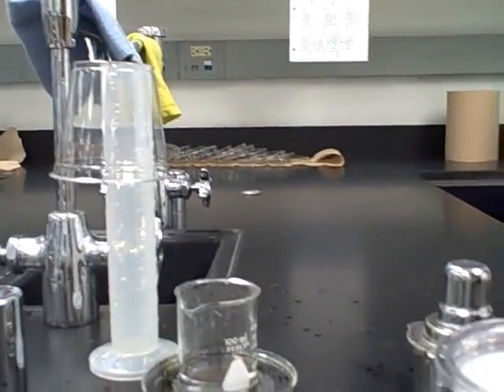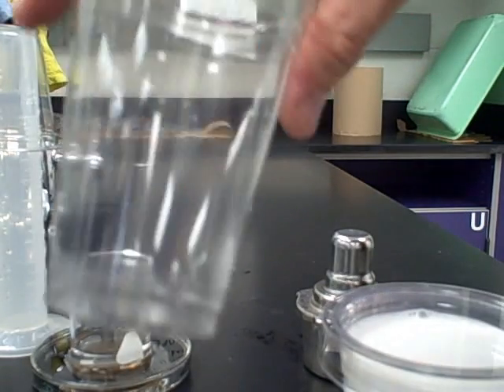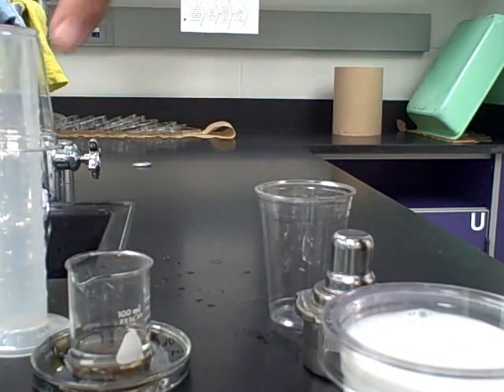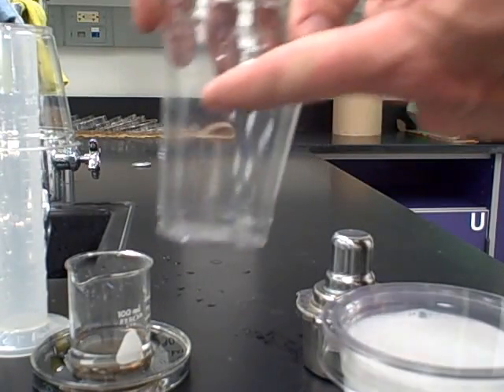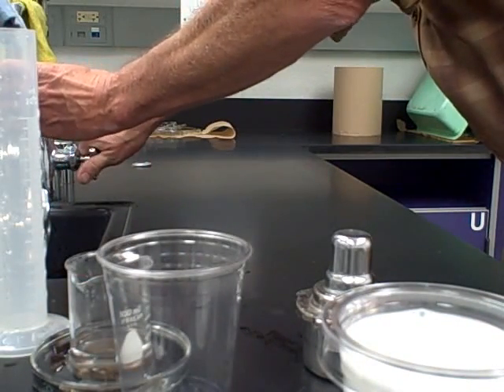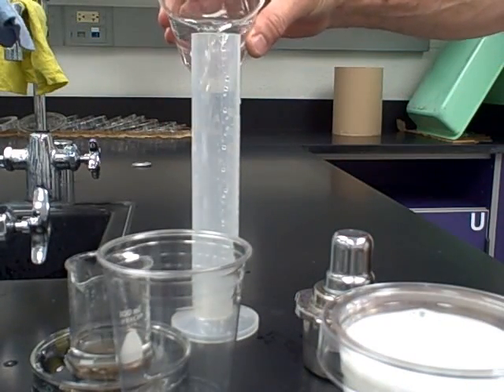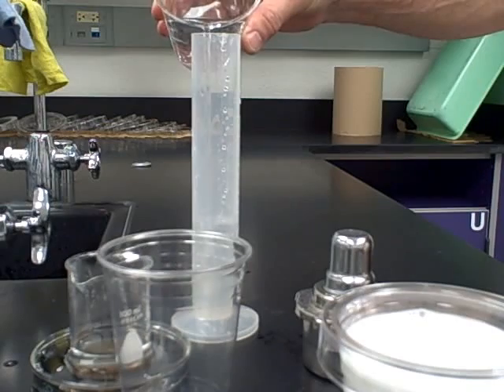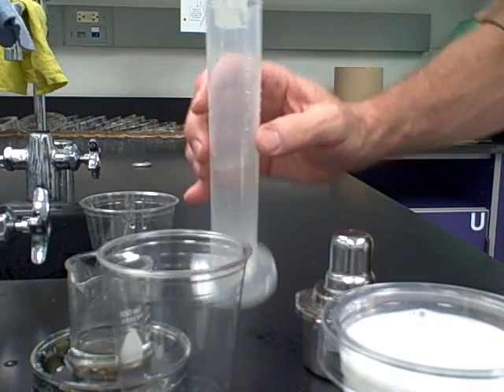One individual in the lab group can carry out that heating procedure while another carries out this next step. Take the tall cup — not the short cup we use for getting water — and we have to mark a line at 60 milliliters. Simply measure out 60 milliliters in your graduated cylinder and pour it into the cup.